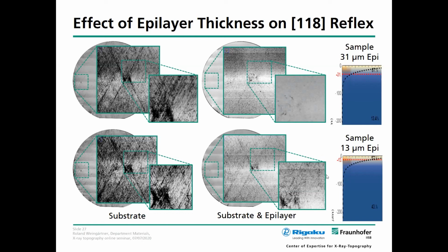A little bit more complicated for thin samples, of course, since we have a deeper penetration inside the crystal. We see now here 40% from the substrate. So the defects we see here carry a lot of information from the substrate. Here you really need to compare to see if you have an improvement or not. Of course, you see you have an improvement of the epilayer. Nevertheless, the separation between homoepitaxial layer and substrate becomes more complicated for thin samples.